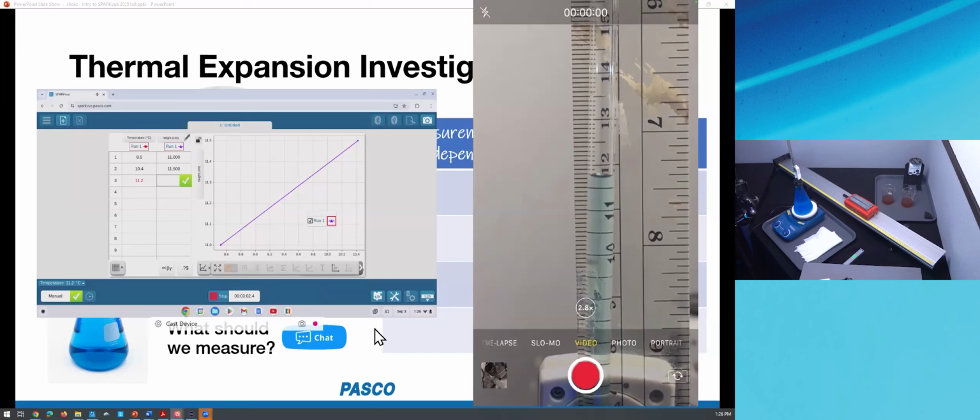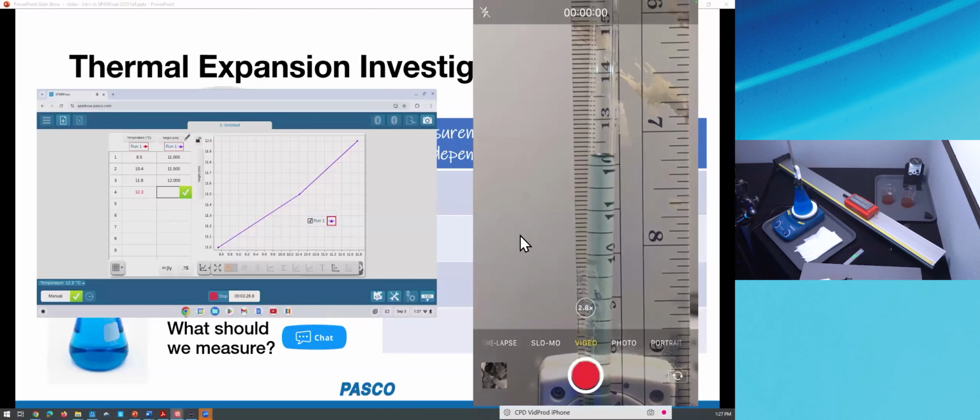So this manual sampling technique is great if you want to correlate a sensor measurement with something from the real world, whether it's measured off a ruler or off of a volumetric measurement like a burette for a titration. I'm at 12 now, so I'm going to press keep at 12 centimeters. We'll get a couple more data points here. While we're waiting for that to go up, you might be able to see it's rising visibly now in the live camera feed.